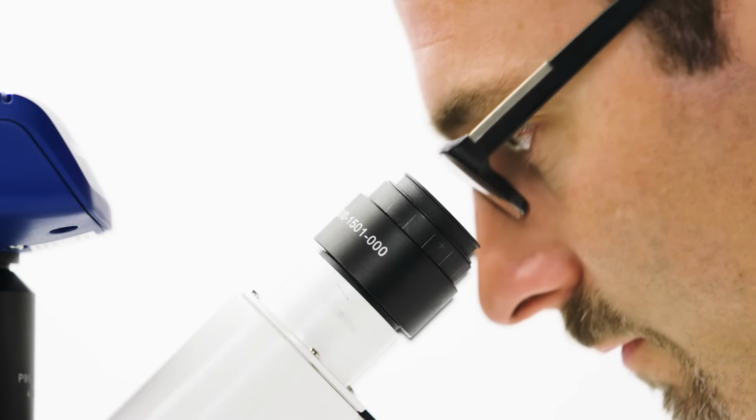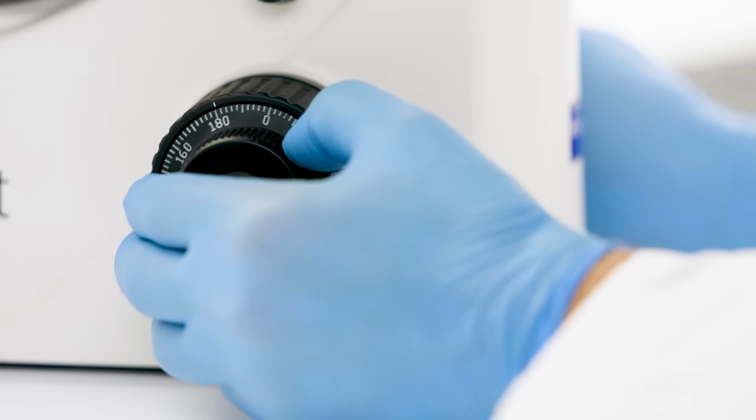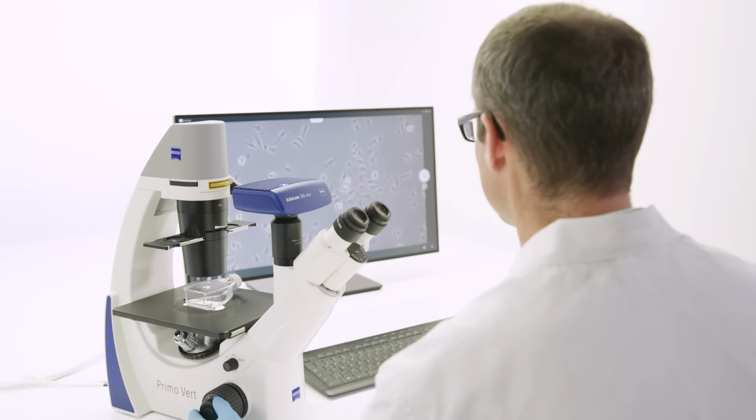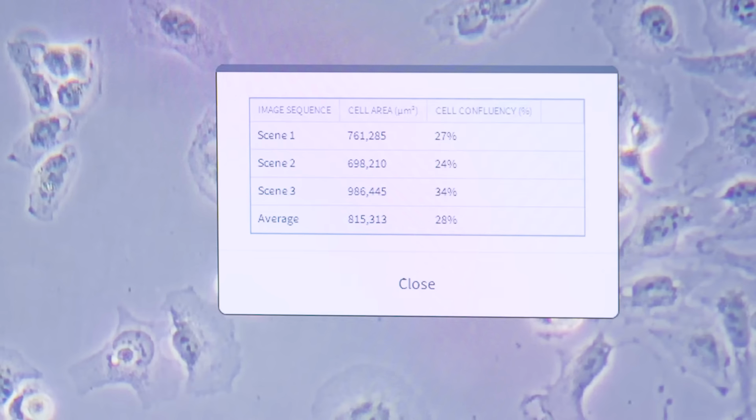Work with adherent cell cultures? Then estimating cell confluency is a known procedure to you. Based on this value, you may decide on cell proliferation, viability, and the perfect timing to start transfections or when to passage your cells. Visually done, defining cell confluency can be a rather subjective and error-prone process with varying results.